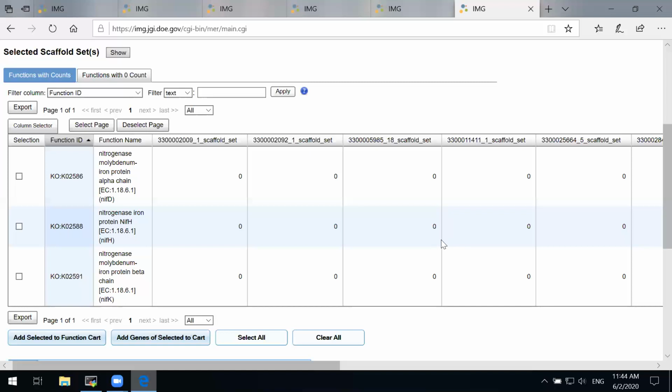But there is also an alternative explanation: that the absence of nodulation and nitrogen fixation genes is a technical artifact of the metagenome binning process that we have. And it's actually a very likely explanation if you think about how it is done. If you attended the Metagenome Bins webinar, or watched the recording of it, you would know that metagenome binning is using 2 parameters in order to assign metagenome contigs to the same bin, to the same set of contigs and scaffolds that are likely coming from the same population.